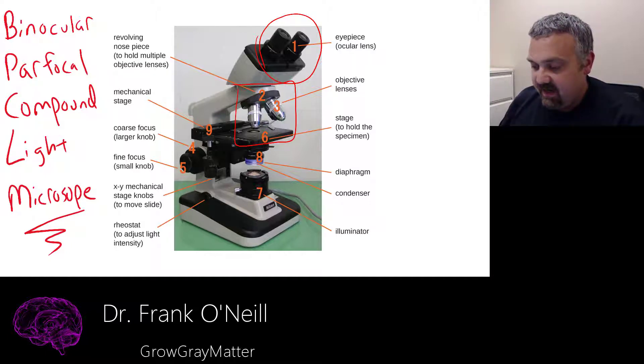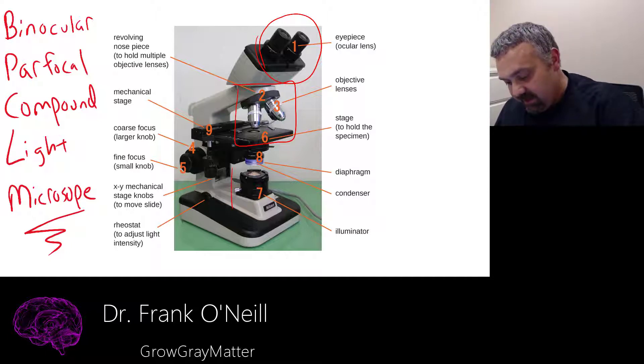And we also have an ocular lens as well, which oftentimes is a 10x magnification, but it can be 20, it can be 25. So binocular parfocal compound light microscope because of the illuminator here.